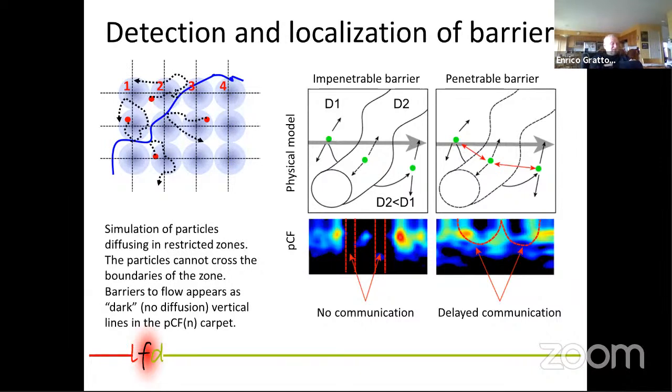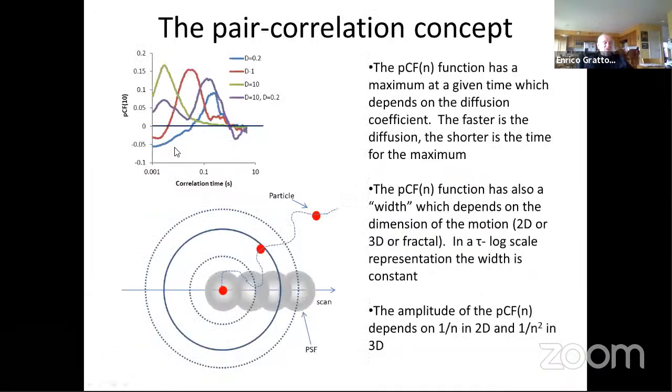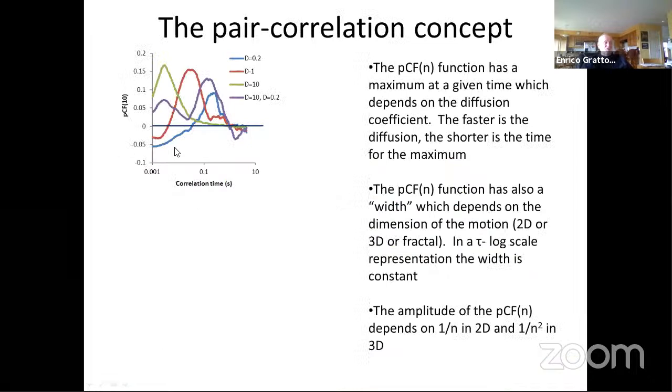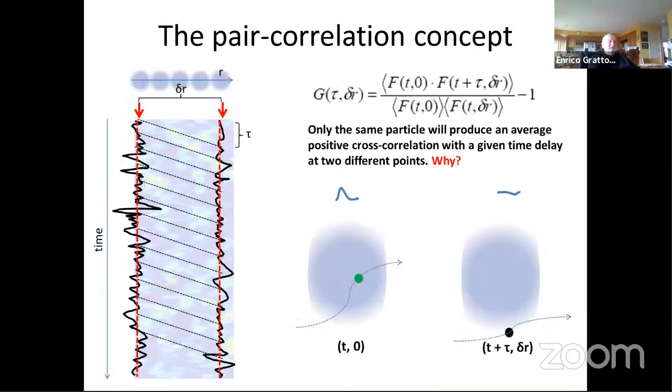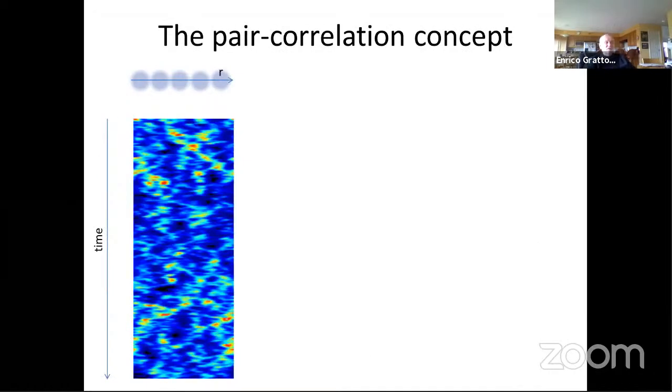I didn't discuss the negative part. The negative part of the correlation function is very important. The fact that you go negative means that the particle which is in one position cannot be in the other. So you see all those curves have a negative part simply because at that distance the particle cannot be measured. So in this graph, the particle is here and cannot be there. It's anti-bunching, a special anti-bunching.